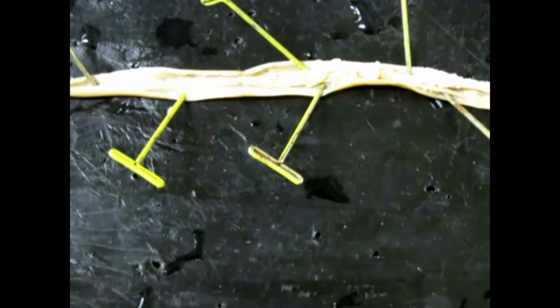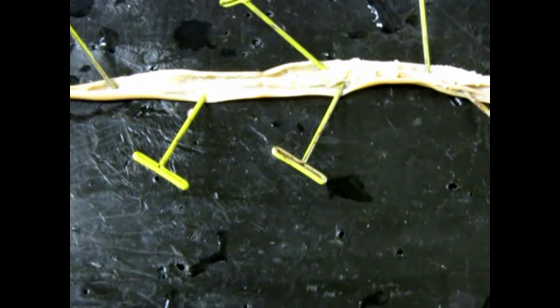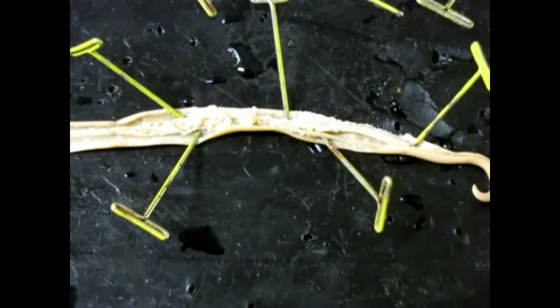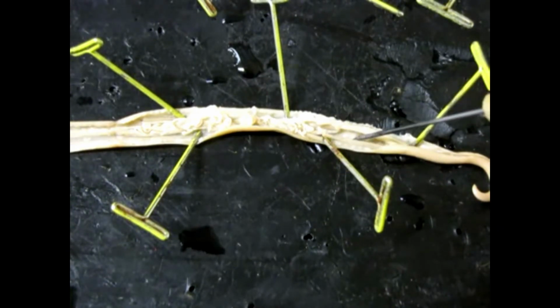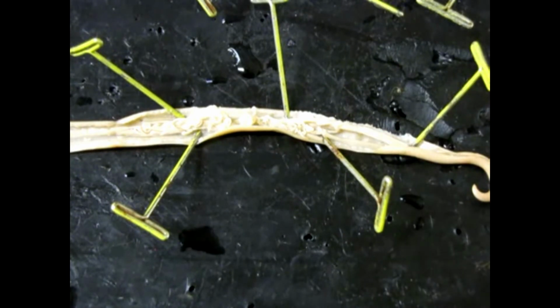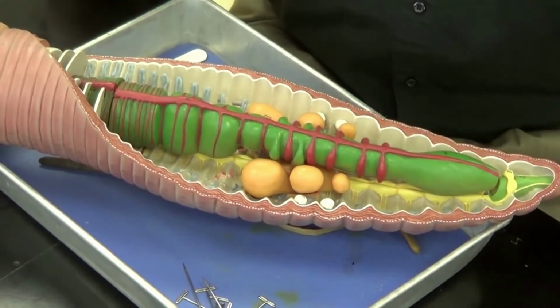So you'll recall then, just to point out some differences, the genital opening for the female is at the anterior end, the genital opening for the male is at the posterior end, and the female has two large tubes that meet at a Y. Those are the uteri, whereas the male only has a single large tube, which is the seminal vesicle. So those are some differences on the interior of the animals, and that's about it for the internal anatomy of the roundworms.